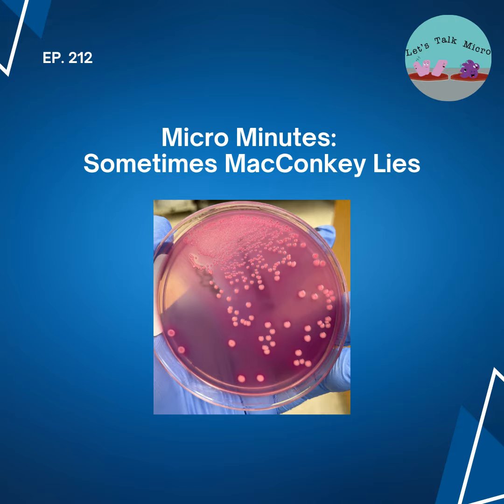So if it's growing, it is a gram-negative rod, right? Well, that might not be the case. Did you know that yeast can grow on MacConkey agar? You can see organisms like Candida glabrata, Candida parapsilosis, they can grow on MacConkey.